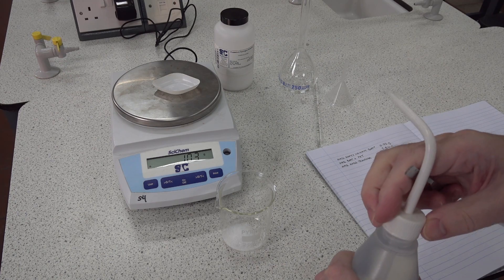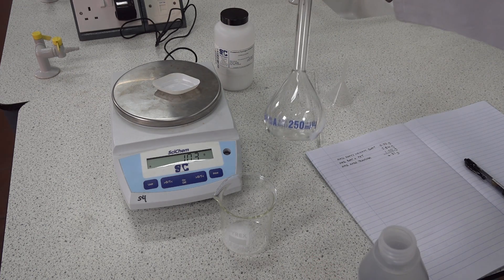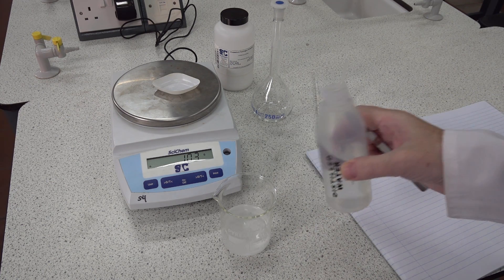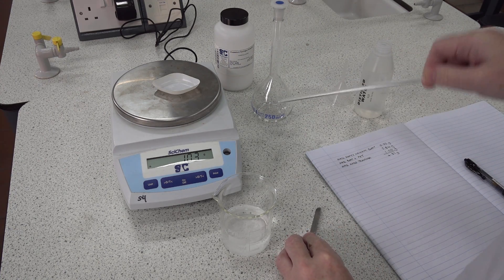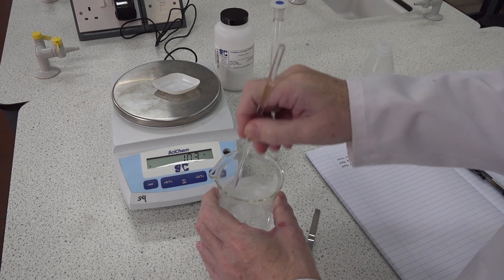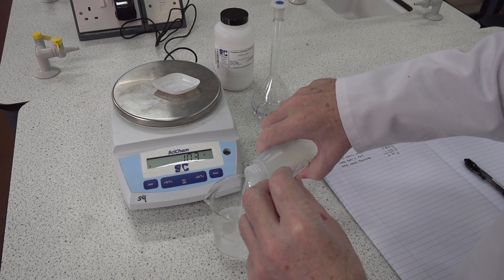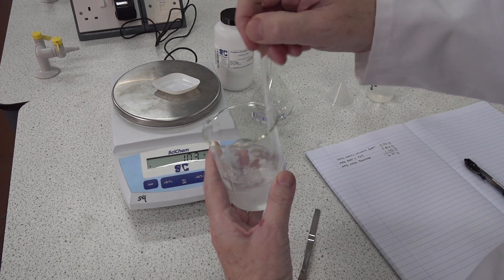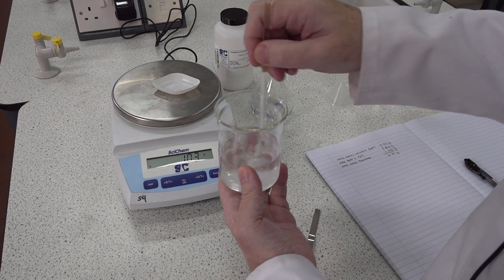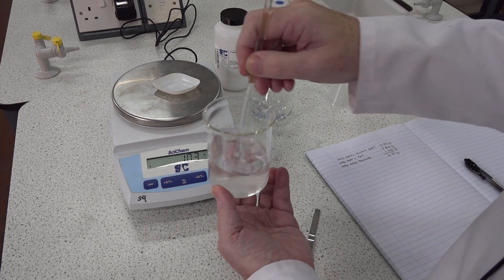We next need to add some distilled water. Since we're going to be making up 250 ml of solution, we can add at least 100 ml of water to the beaker quite comfortably. Students then need to stir, and this does take some minutes. Students would be required to stir until the potassium hydrogen phthalate has completely dissolved in the water.